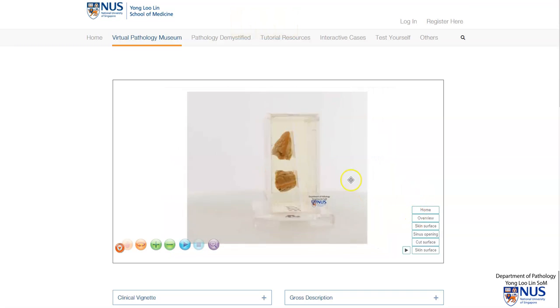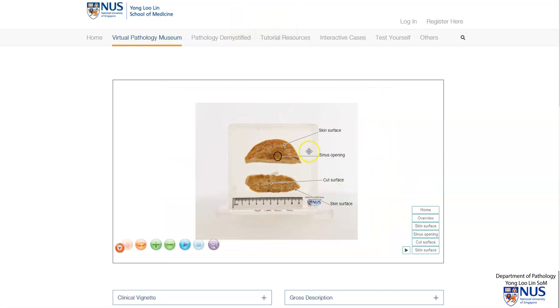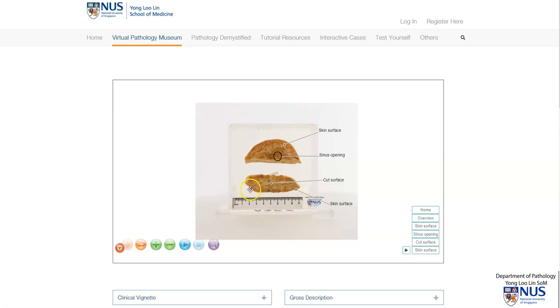Let me show you the labels. We have the skin surface, and a sinus opening here, which we will take a closer look at later. Here is the cut surface. And on this bottom piece, the skin surface is actually at the lower edge.